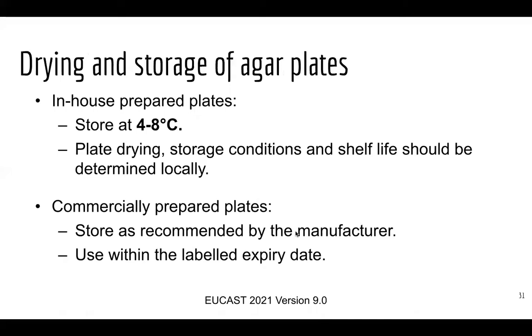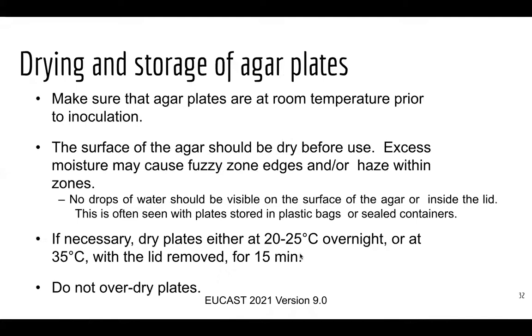When you make plates, you tend to store them at between 4 to 8 degrees, in a cold room or a typical fridge. I tend to seal the plates that I make, and they can last for quite a few weeks. But they will eventually start to get contamination or dry out and thin, and then they're not usable anymore.